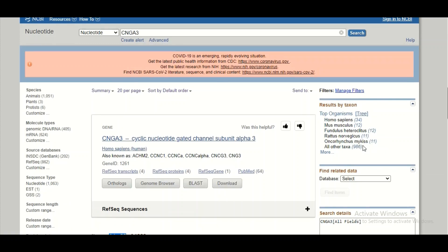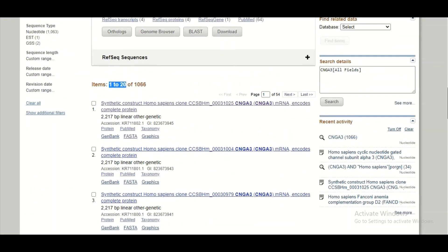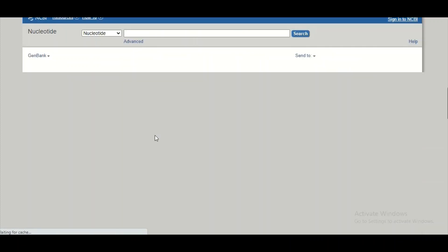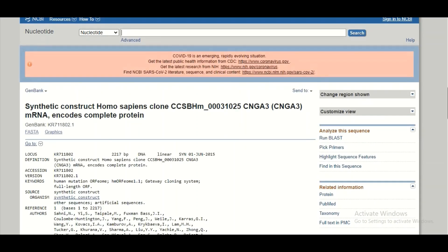In the top right corner of the page, there is a further breakdown: among the 1066 sequences, 34 belong to Homo sapiens (humans) and 12 belong to Mus musculus (mouse). Let's assume I'm interested in a synthetic construct of Homo sapiens CCSBHM. I will click on it, and after a moment I will land on the page specific to this CNGA3 sequence.